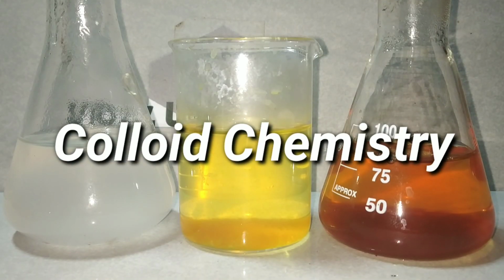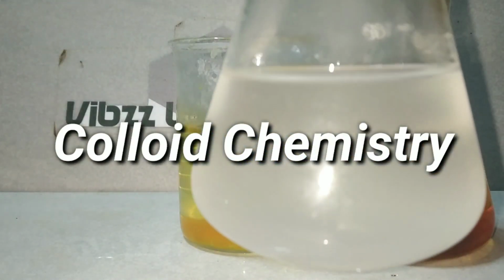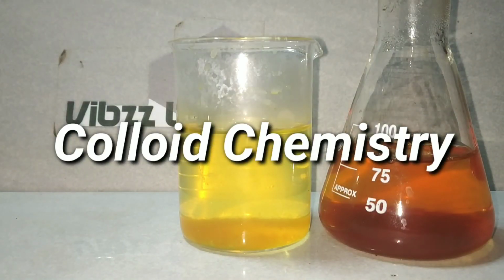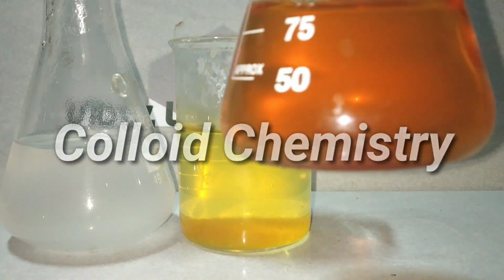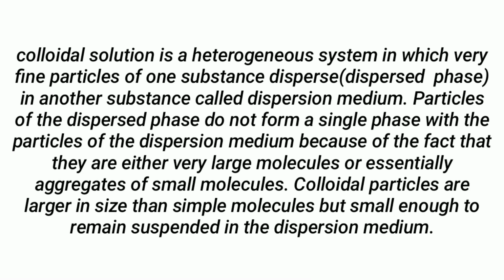Friends, in this video we will learn some basics on colloids and we will be making some colloidal solutions, better known as sols. So what is a colloid? A colloid is a heterogeneous system in which we have very fine particles of a substance dispersed in another substance. These are called the dispersed phase and the dispersion medium respectively.